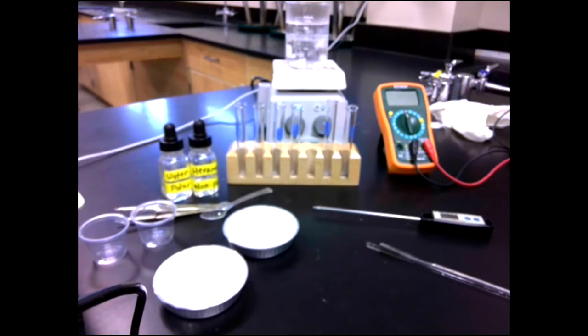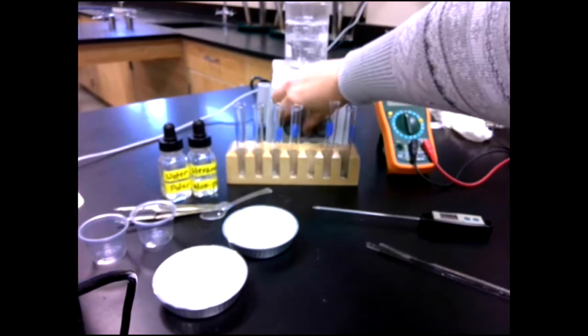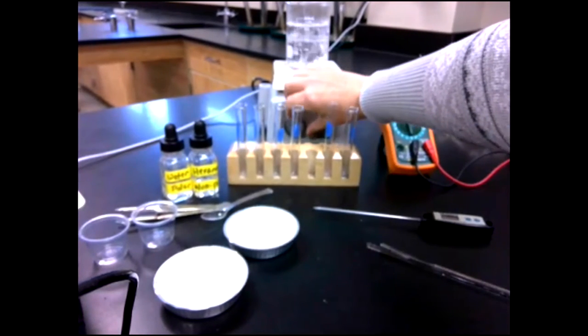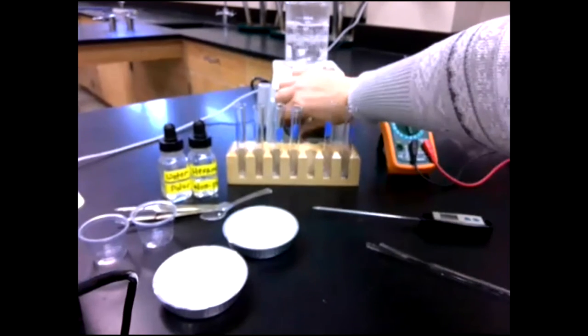We're gonna look at two compounds and we're gonna look at the properties and figure out which compound is ionic and which is covalent. This is boiling now. I'm gonna turn it down. I want it to boil, but it's gonna all evaporate before we get to it.